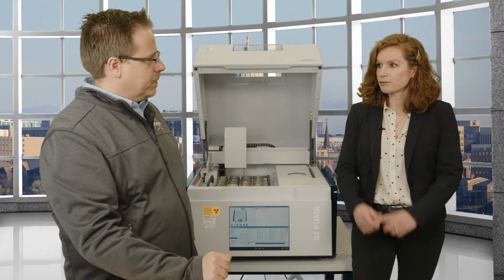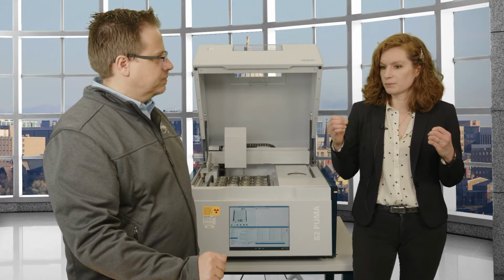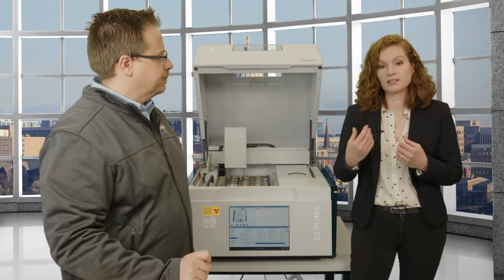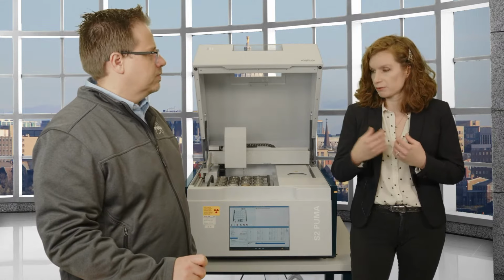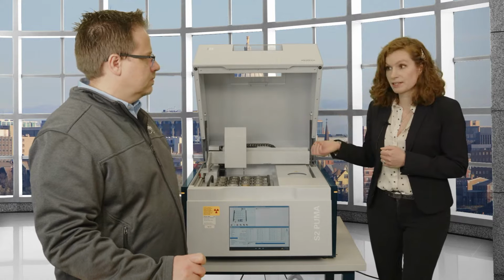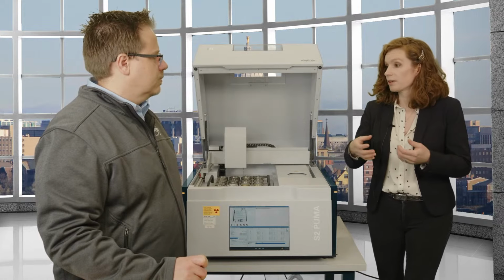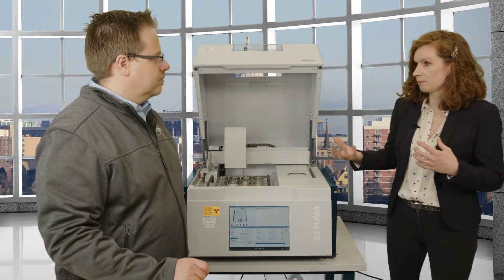The accuracy really depends on what is your set of standards that you have. How good is their value? And that's going to be a measure of, do you get the right number, right? Correct. Standards, usually certified reference materials, have been measured in different ways and by different labs. Otherwise, they wouldn't be certified. And with the standardless program, that depends on the algorithm that's being used and also how much was there to begin with to try out different things or to accommodate different modes, different samples, and so on.